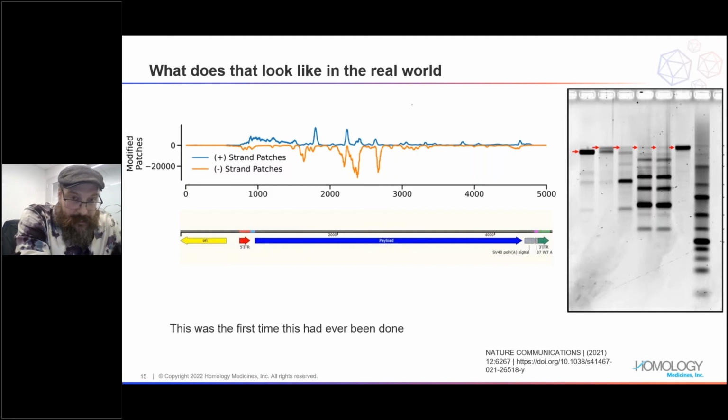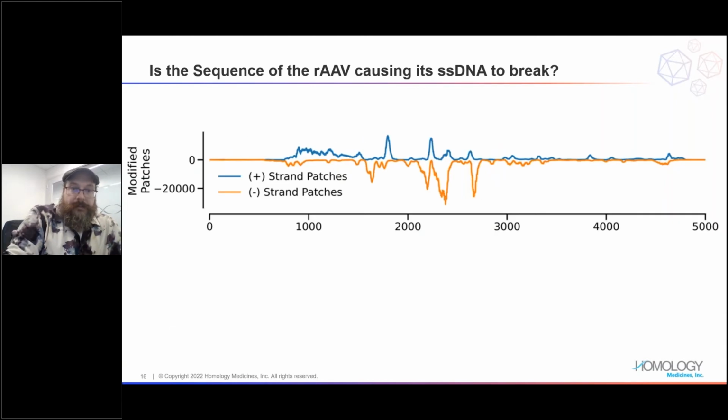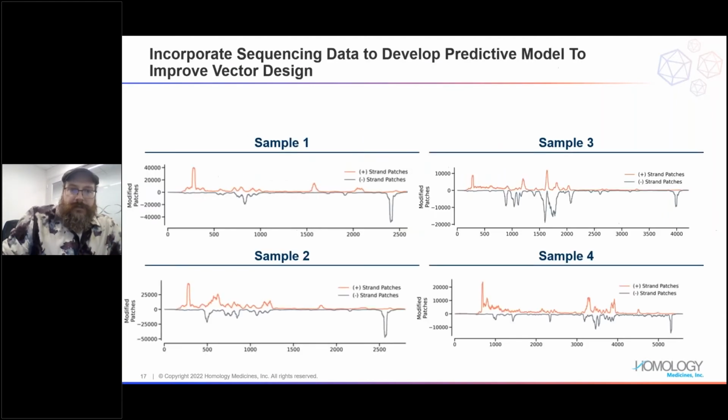And we're really excited because, as you can see here, we were actually able to map out where the positive strands were breaking, where the negative strands were breaking. So, of course, that allows us to do things like you will see on the next slide, which is we can have these iterative designs. We can go back to our old drawing board and go, oh, okay, well, we need to fix this part, and this and that, and this and that.